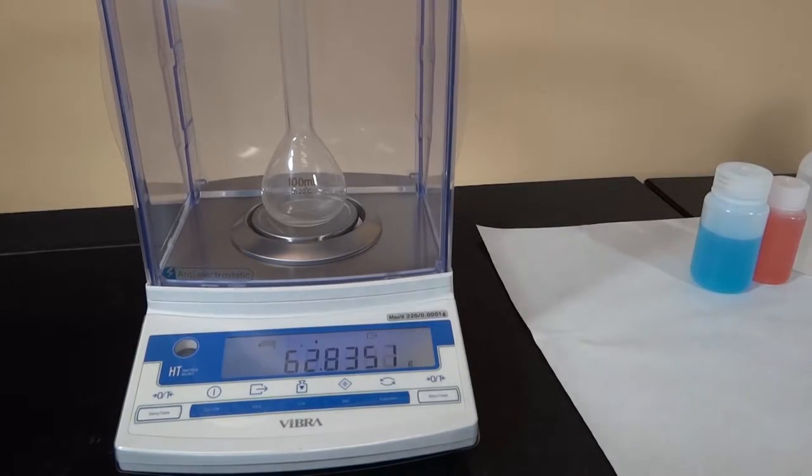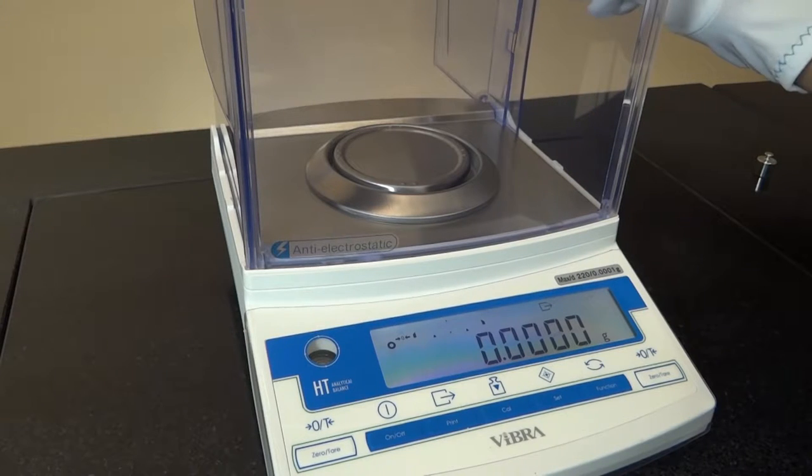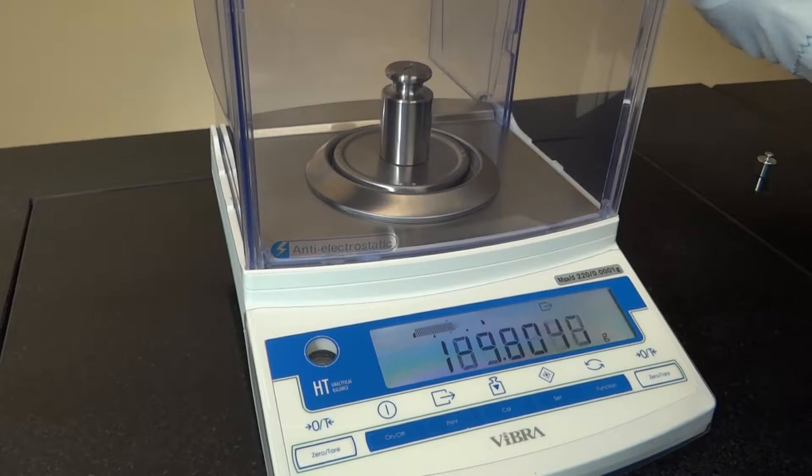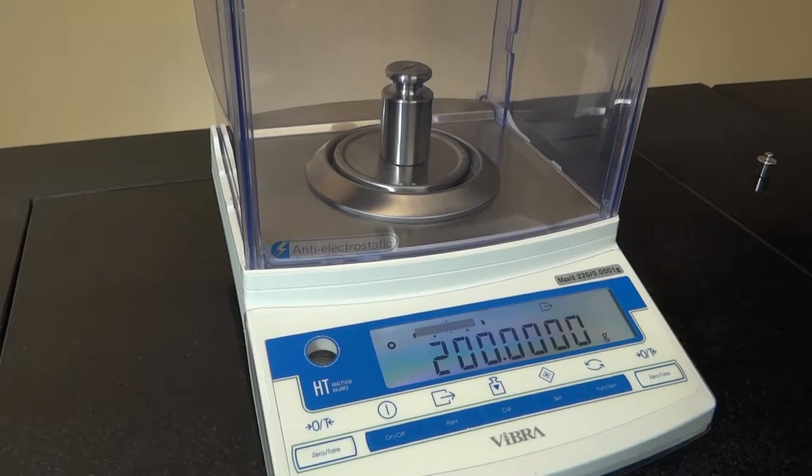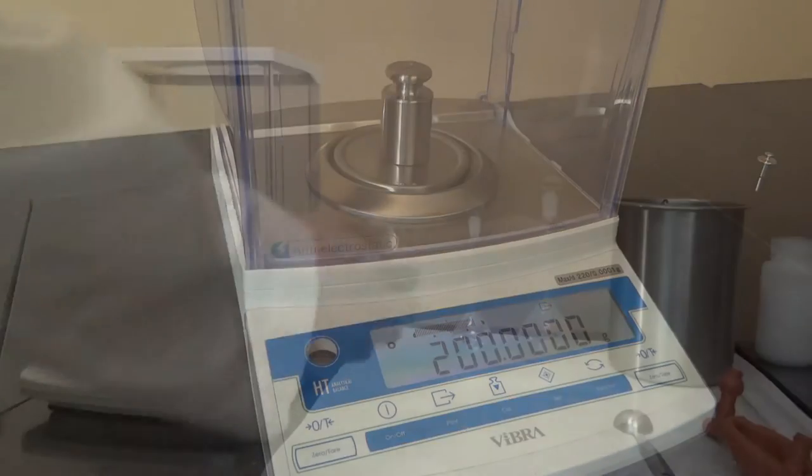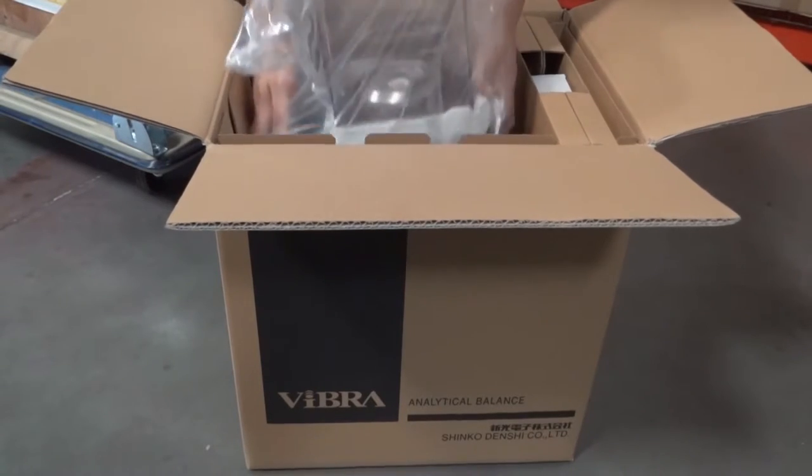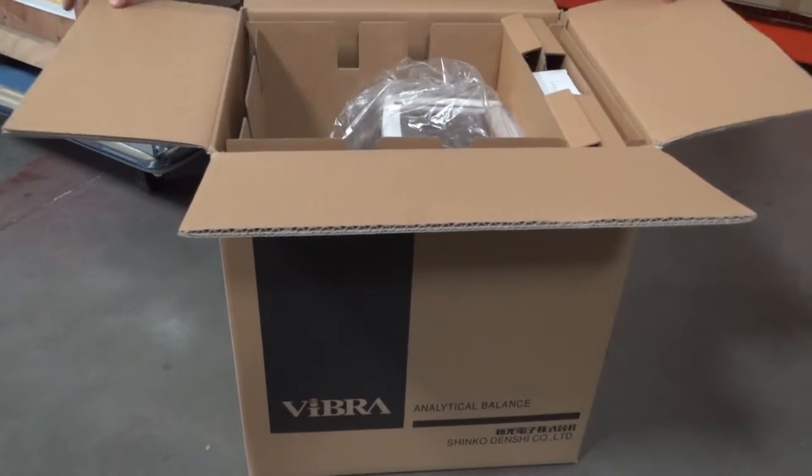It is extremely stable and is unaffected by temperature when the balance warms up, which means the HT will provide its maximum performance and minimal drift within minutes of turning on. Most analytical balances take hours to warm up. The Tuning Fork Sensor is also incredibly resilient to shock and overloading, making it safe to ship from one location to the next without the fear of shipping damage.